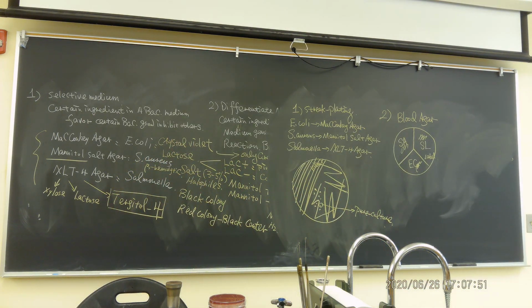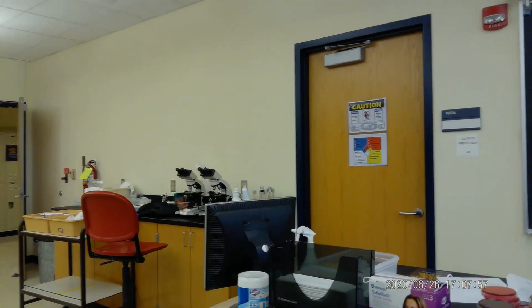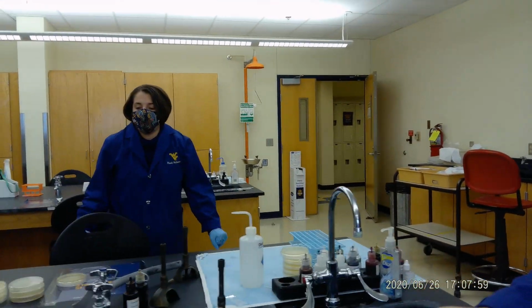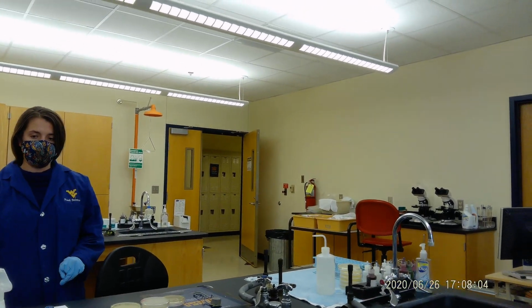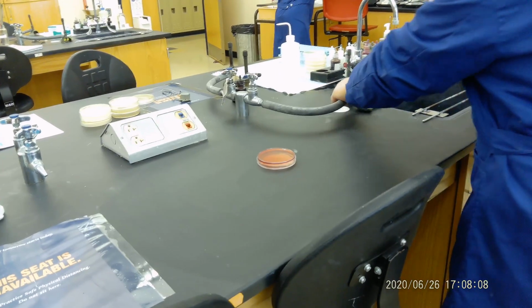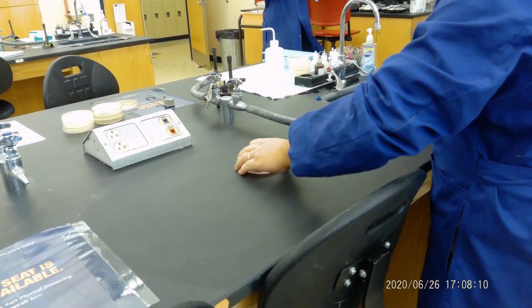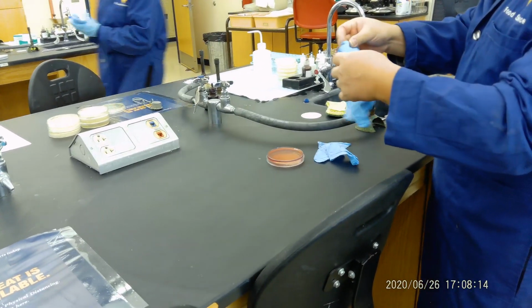So Sean, you're going to help me a little bit. And I'll just use MacConkey agar. Just come here. And I want to have gloves. Do you have gloves? Thank you very much. So we're going to show you how to do this.